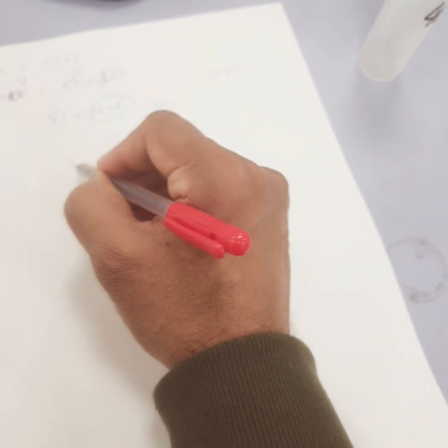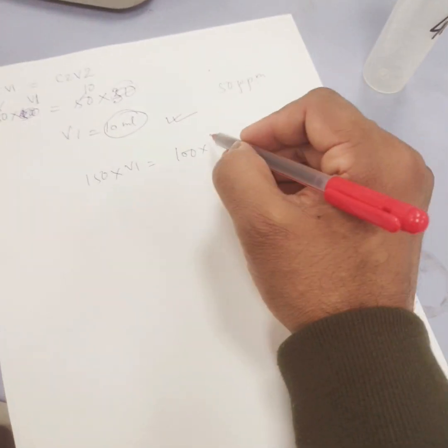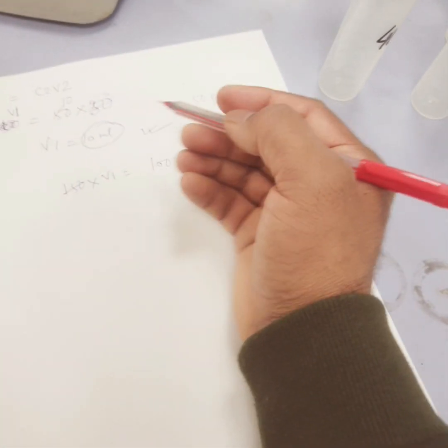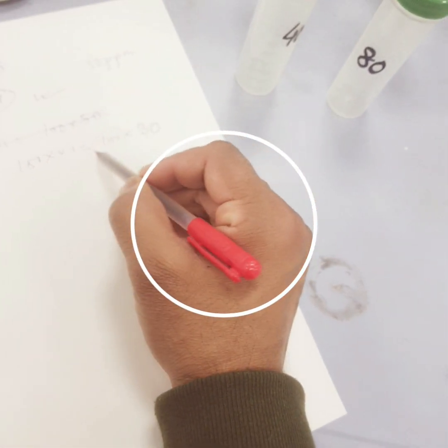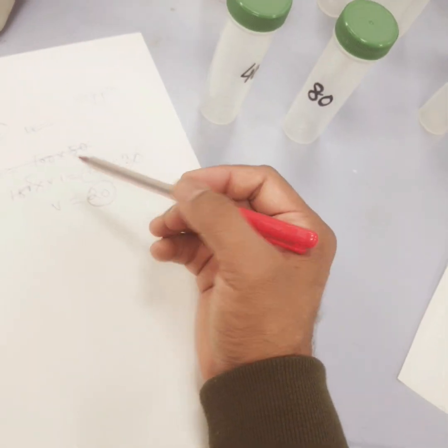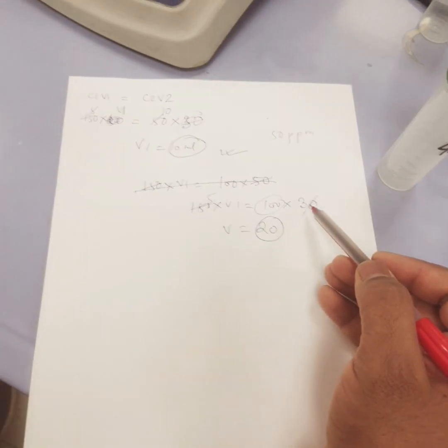Suppose we want to make 100 ppm, in 100 ppm we are making 30 ml. So we have to take out 20 ml from 150 and add the rest, 10 ml, of distilled water.